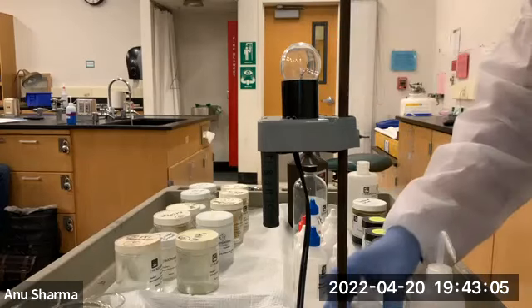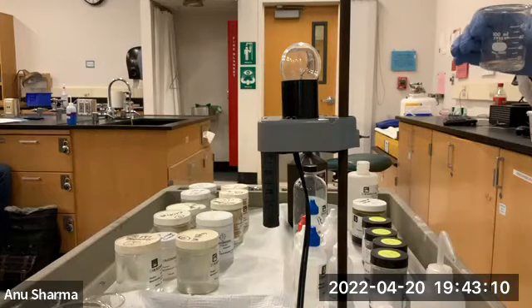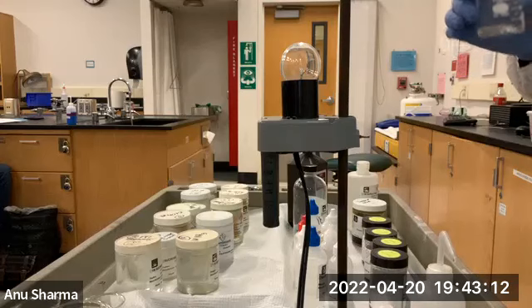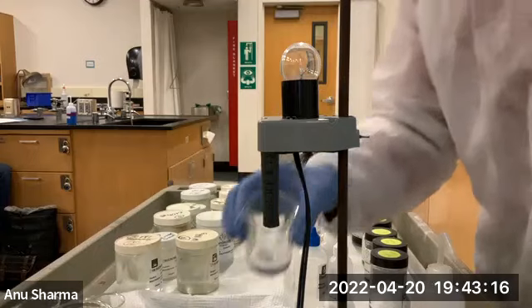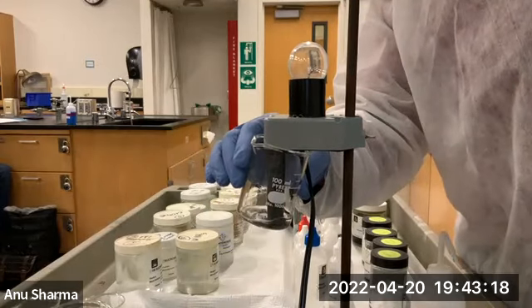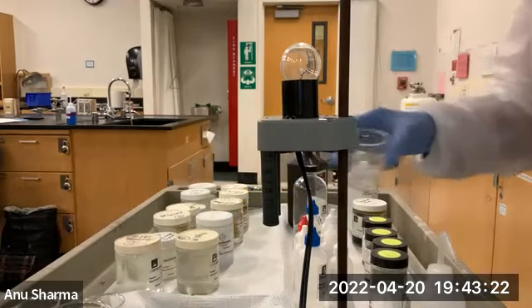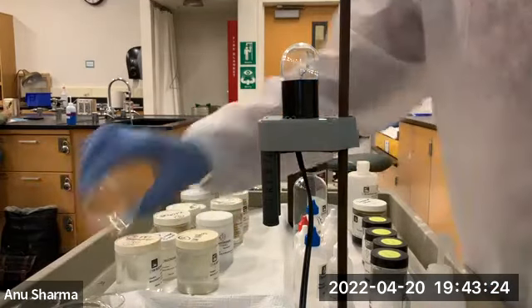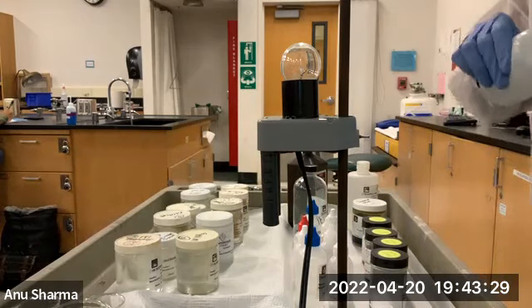Now, will it break up into ions? No, because it's an organic compound. CH3COCH3 is organic. It's not going to ionize. Hence, it will not conduct electricity. So it's a non-conductor of electricity. Okay, guys.